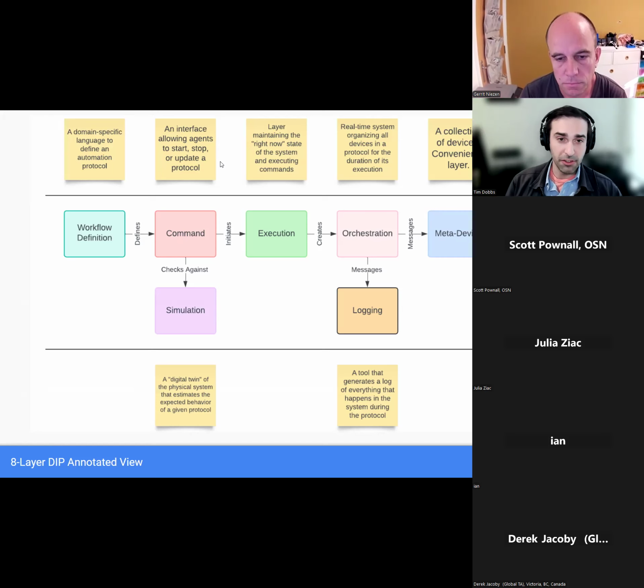Which becomes crucial if you're saying, yeah, I want to do a self-driving lab. I want to do some additional work that closes the loop or that kicks off automation from some remote system I don't have control over. You could provide your API here.